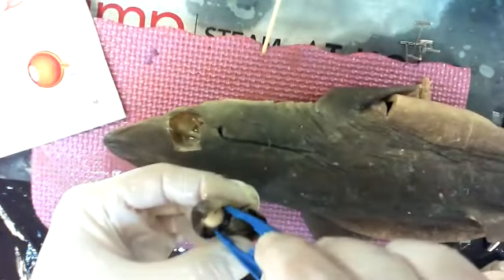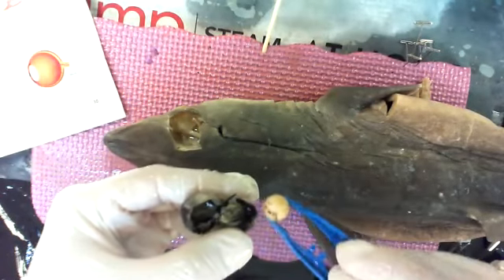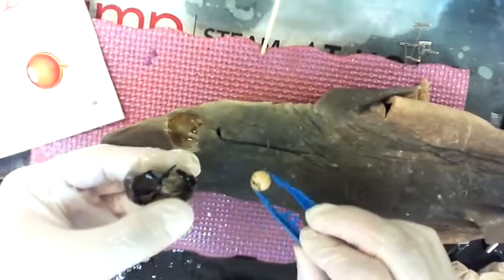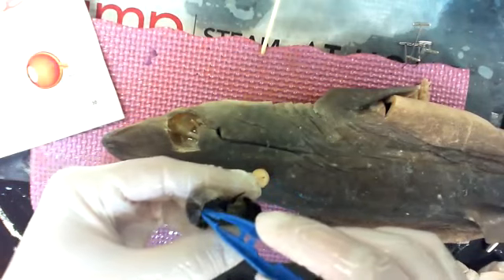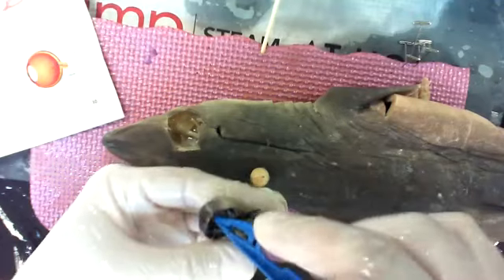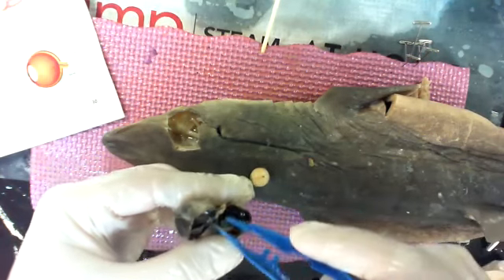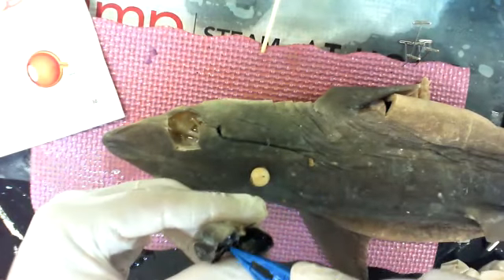Wow, that lens is really big. There's the lens. Nice and round. It's like a marble, or it looks kind of like a used jawbreaker, doesn't it? It's hard. It's not normally hard. Usually it's squishy and flexible. When we look in here, you can see that dark line along here. That's the iris. You can see proteins that are broken down. Take those out. Right. And I'm looking for a lot of these nerves.